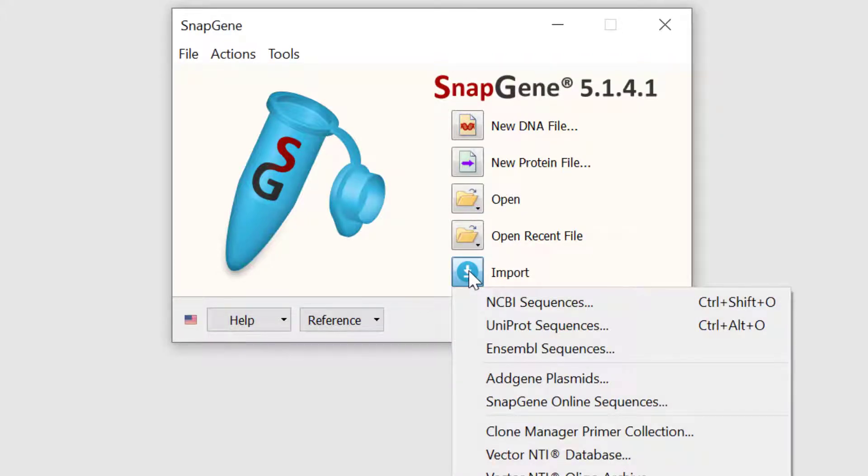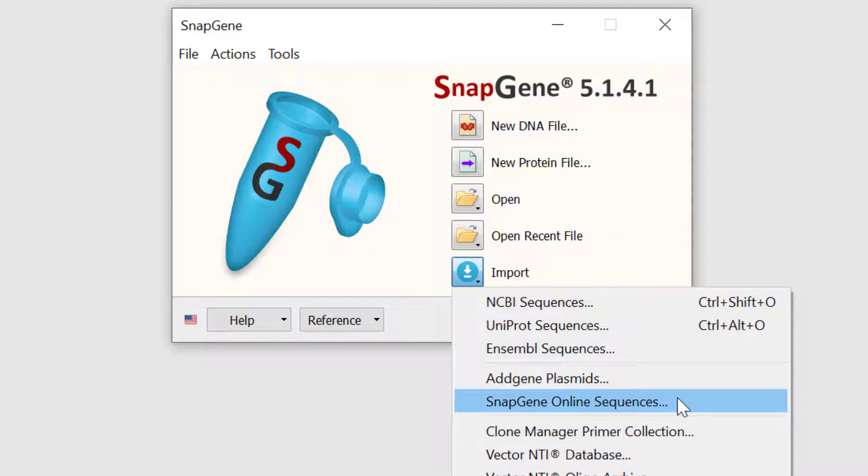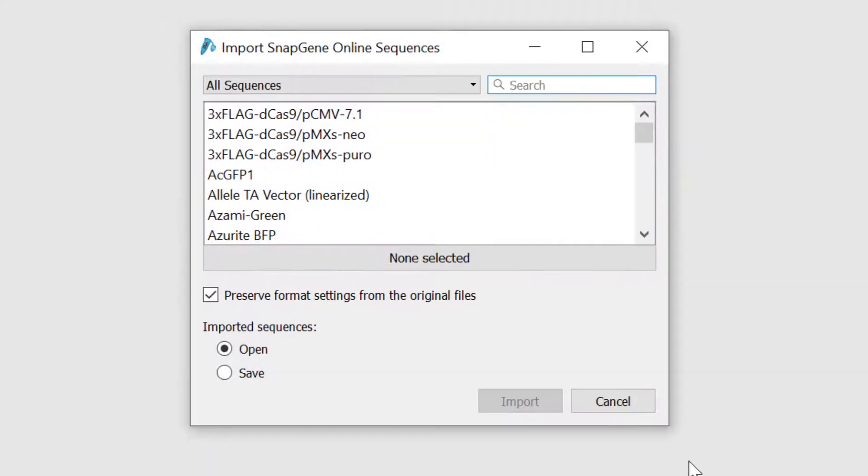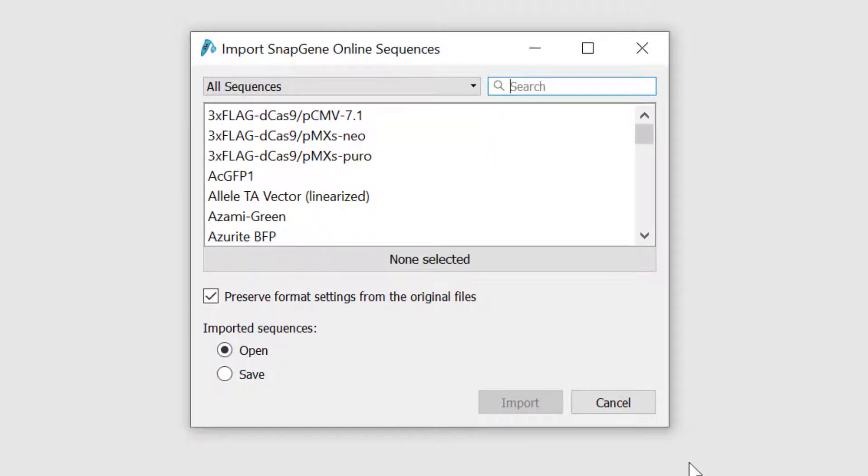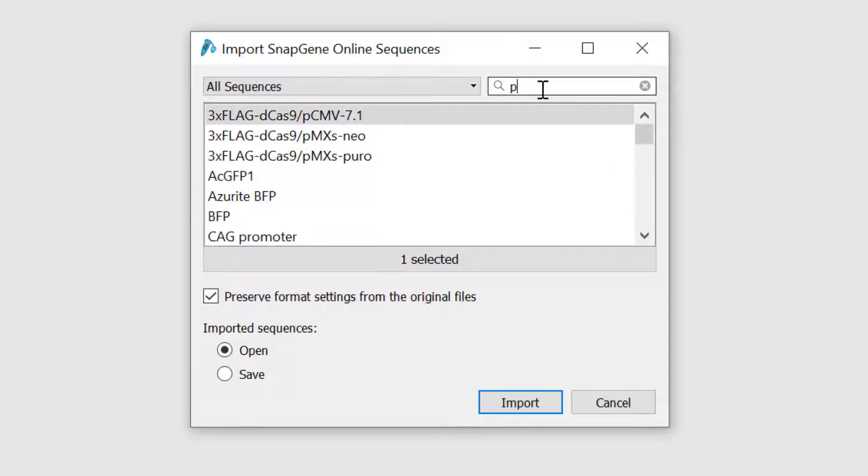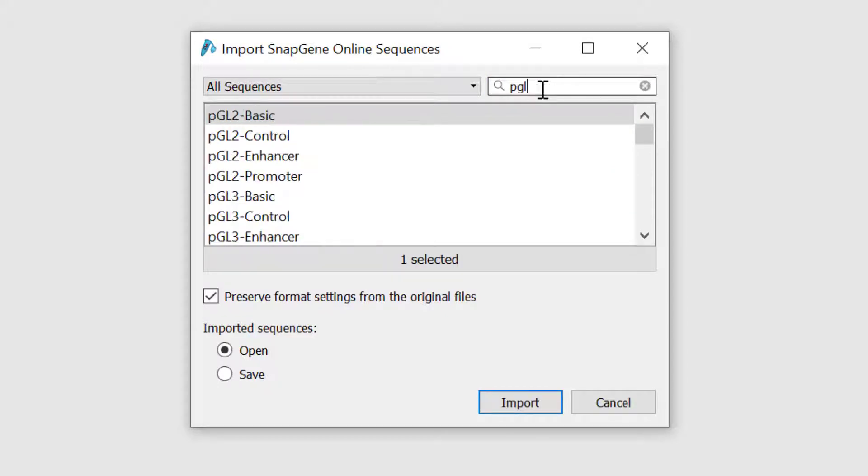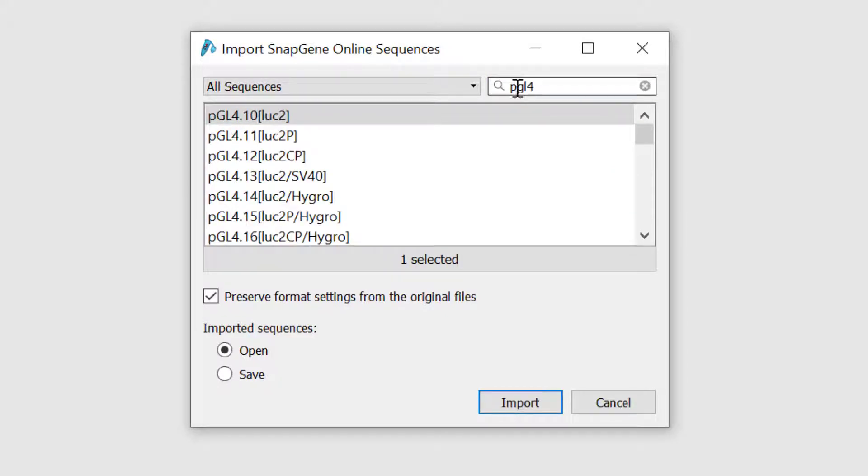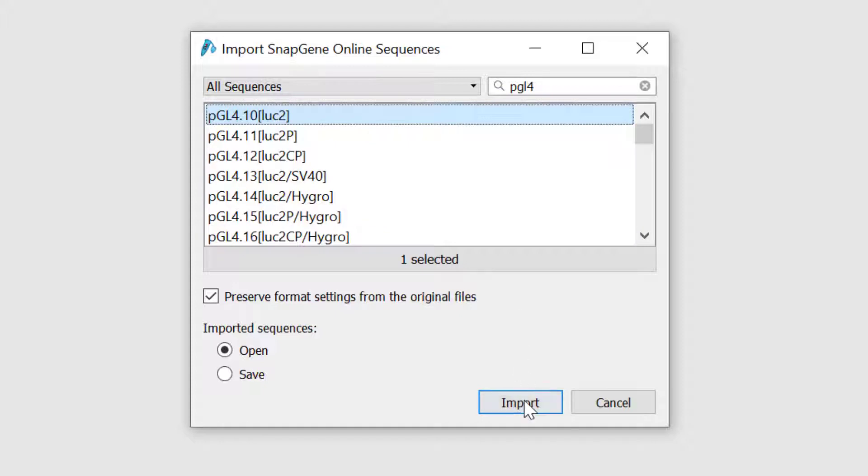For this example, I will use the SnapGene database, so I will select the SnapGene online sequences option. In this example, I will use the plasmid PGL4.10 luc2, so I will use the search bar to quickly find it in the list. Select it and choose import.